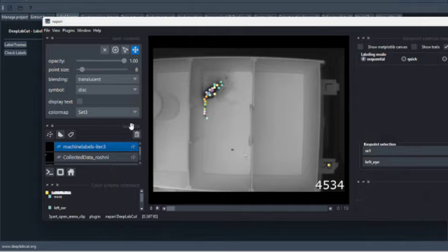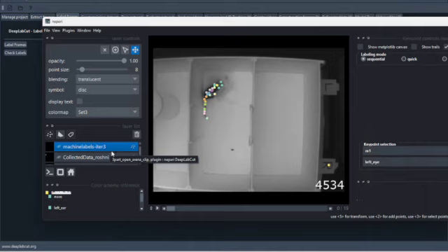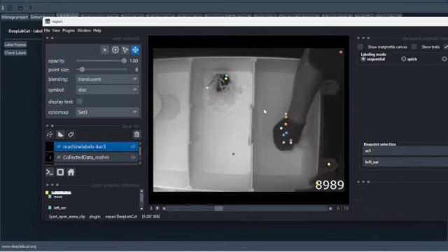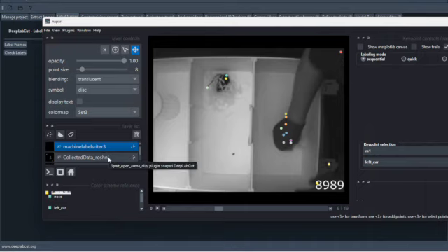So if I did 100 frames yesterday and saved that, and then came back into this and started relabeling machine labels from 100 frames in and then saved this layer machine labels, now my first 100 frames that I did yesterday on the collected data Roshni would be incorrect, and my second 100 frames would be correct.